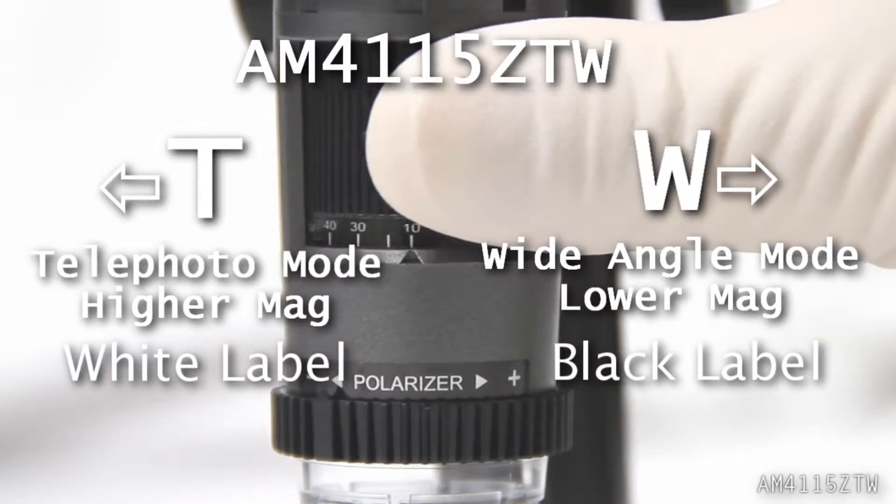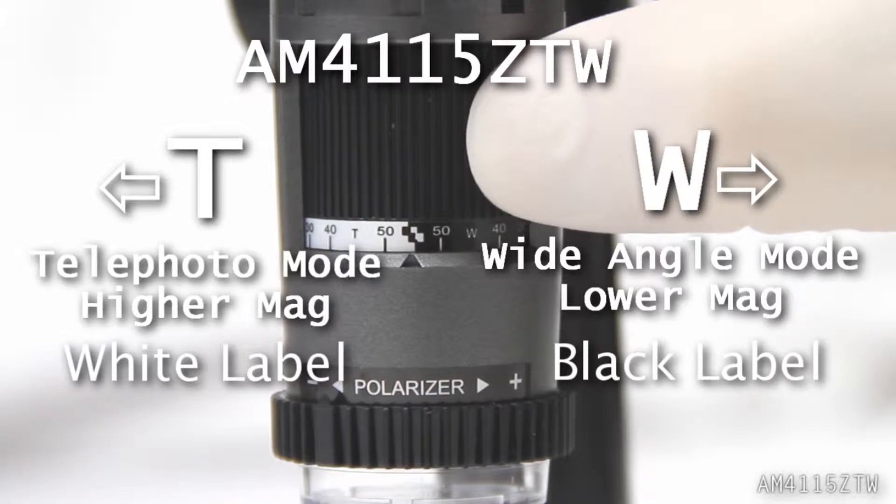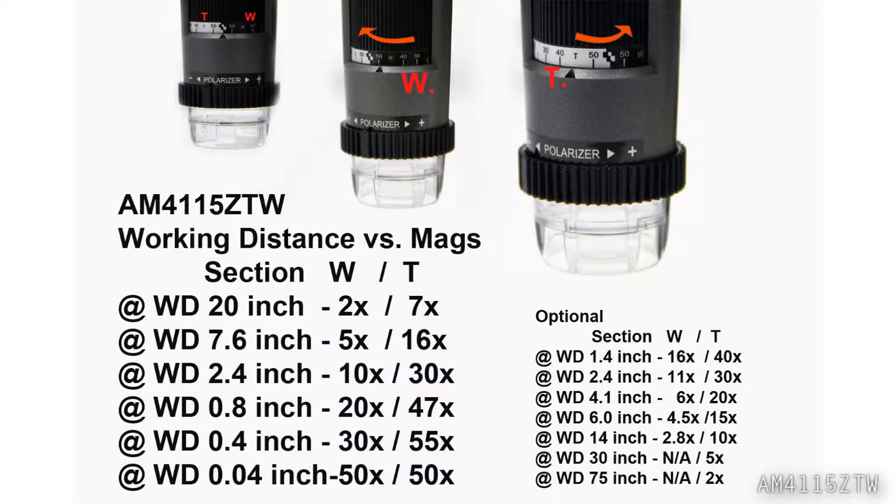The AM4115ZTW magnification dial is split between telephoto mode and wide angle mode. Here is a working distance and magnification chart and some examples.